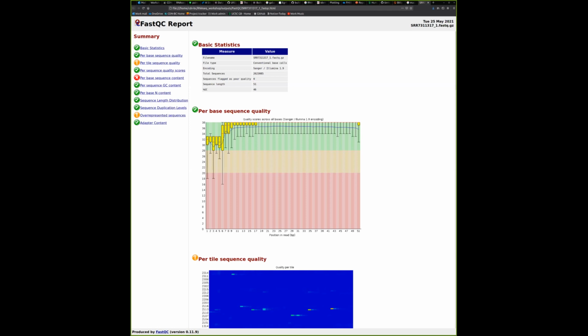Great. Okay, you can go into Finder or your Window Explorer and just double click on the HTML file. Again, we are in this workshop to communicate with our terminal. So it's always nice to know that you are able to open up files, HTML files, or even other text files using commands from terminal. And now we can actually look at the contents of this FastQC file.